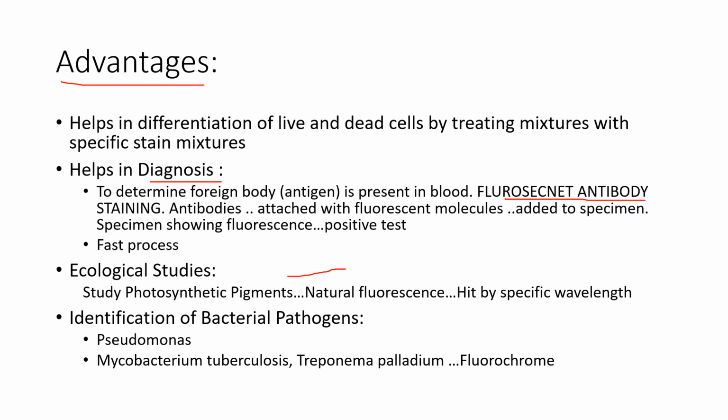How are we saying it? See, when antibodies are attached with fluorochrome, we know that antibodies bind with antigen molecules. And if antibodies are binding with antigen molecules and they are present even after washing the specimen, what does it signify? It signifies that antibodies do not want to leave the specimen because they are already combined with something, and that something is antigen.